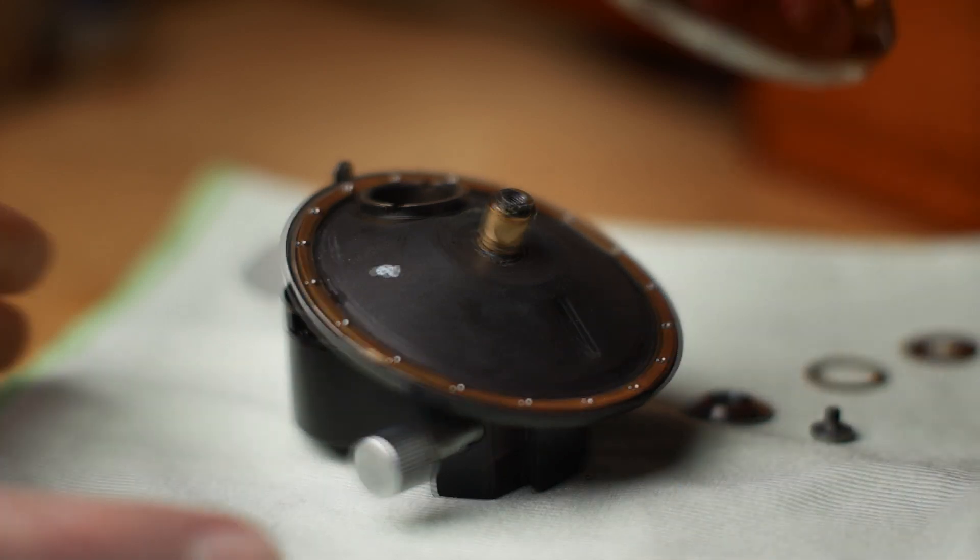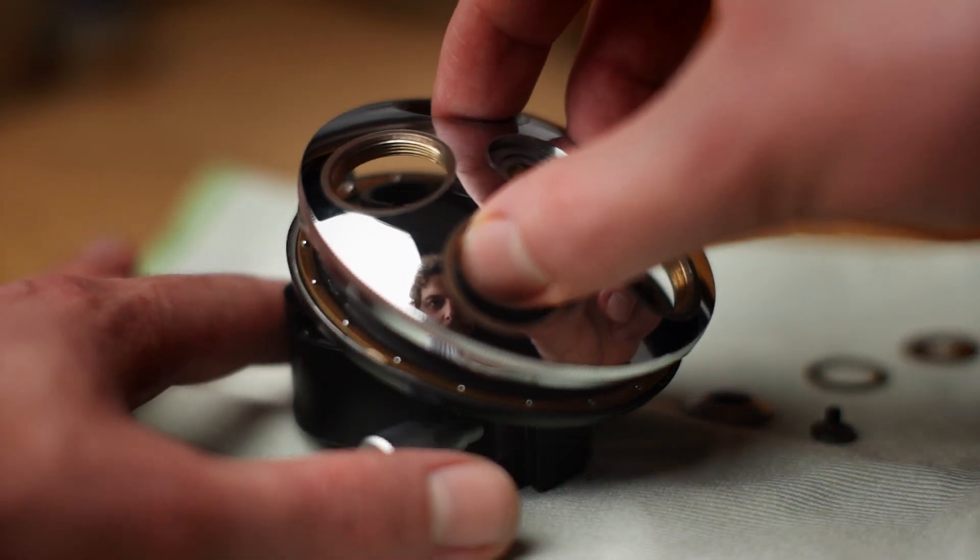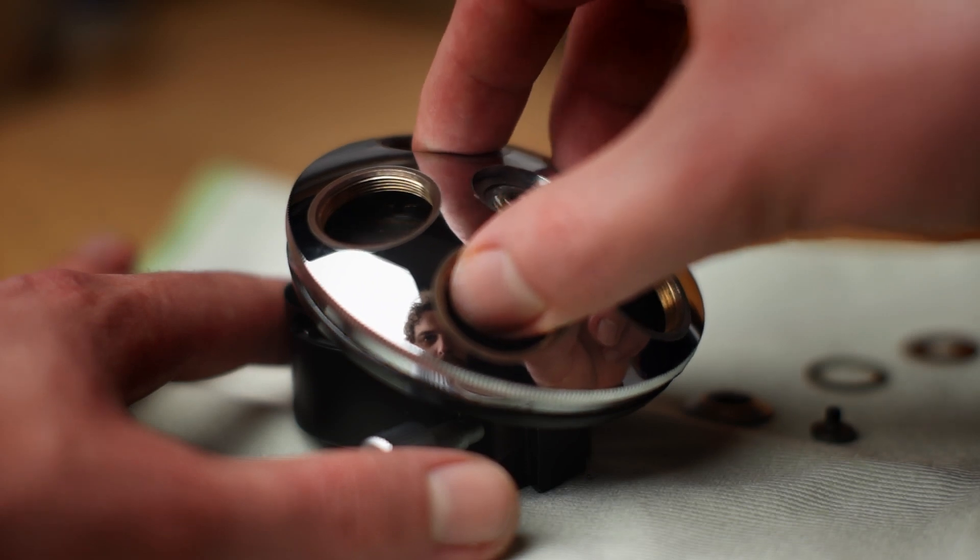With the upper bearing race and central plain bearing also lubricated, the rotating part of the turret is then replaced.